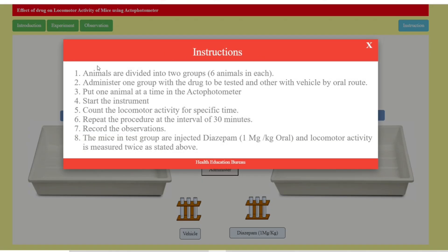Animals are divided into two groups of six animals each. One group is administered the drug to be tested and the other receives vehicle by oral route. Put one animal at a time in the actophotometer, start the instrument, and count locomotor activity for a specific time — around two to three minutes, sometimes up to five to ten minutes. Repeat the procedure at 30-minute intervals. The test group is injected with diazepam 1 mg/kg orally.